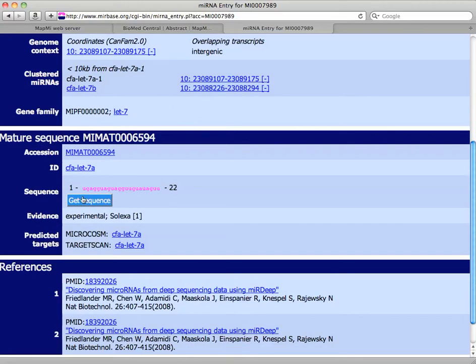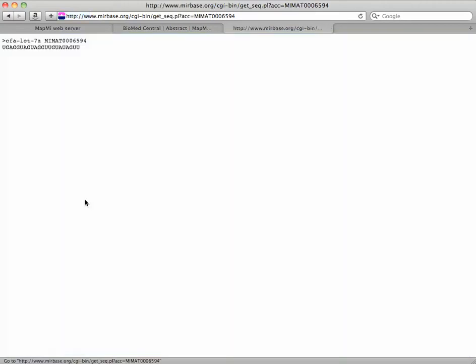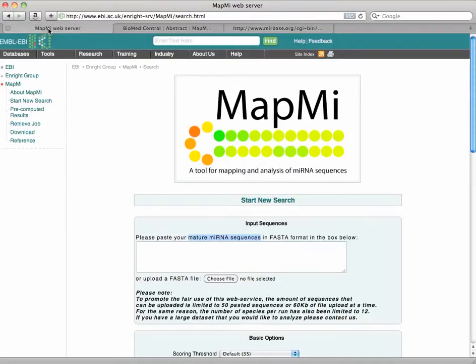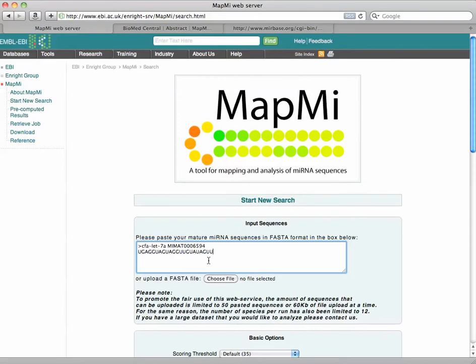Scroll down a little bit and get the sequence for the mature miRNA. And I'm just going to copy and paste it.